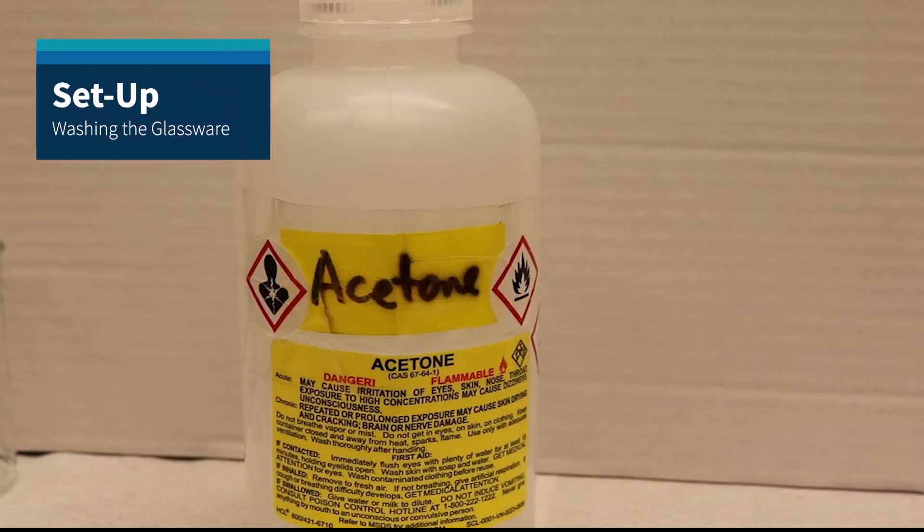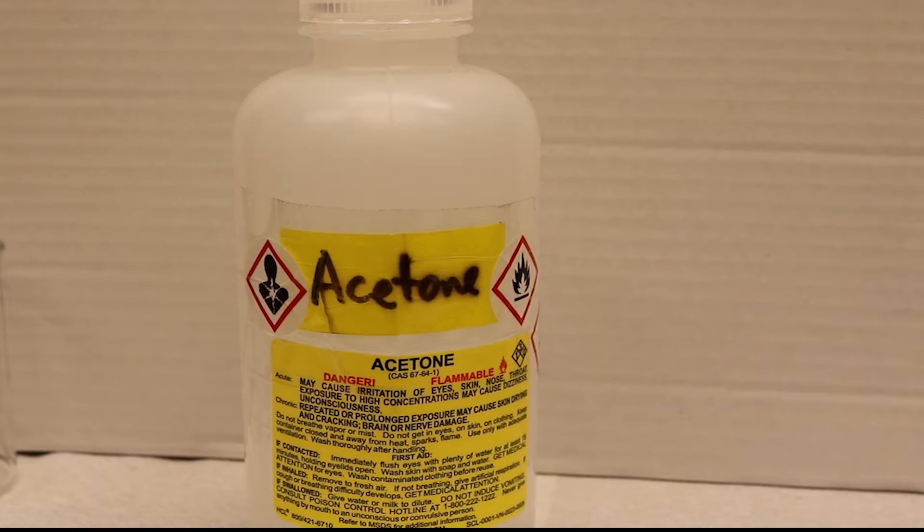Due to the moisture sensitivity of the reaction, it is required to wash and flame dry the glassware and equipment before proceeding with the experiment. It is suggested to wash the glassware with both a polar and nonpolar solvent the day prior.